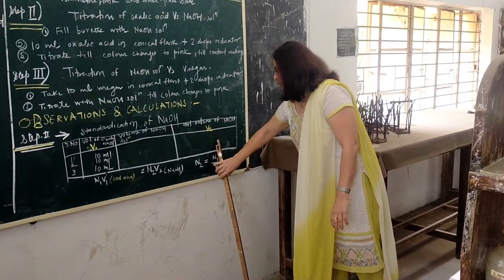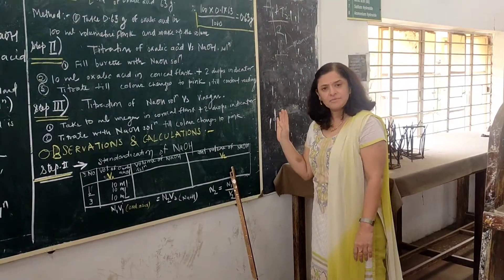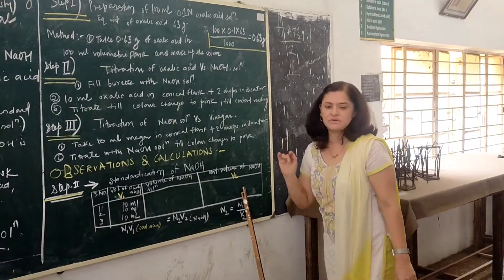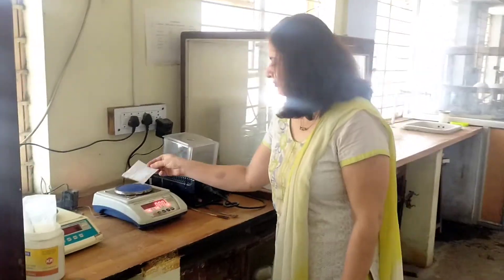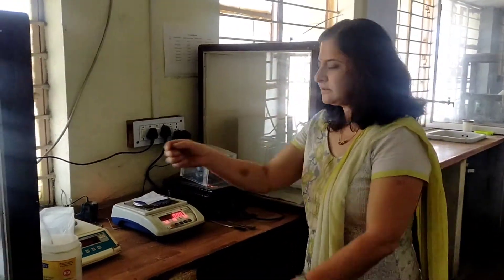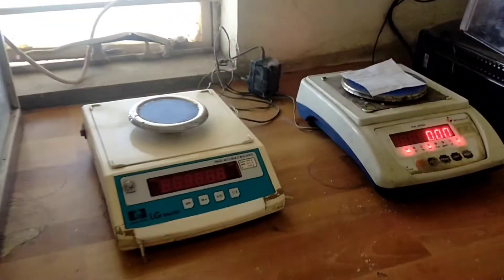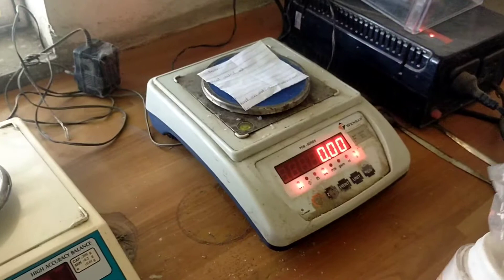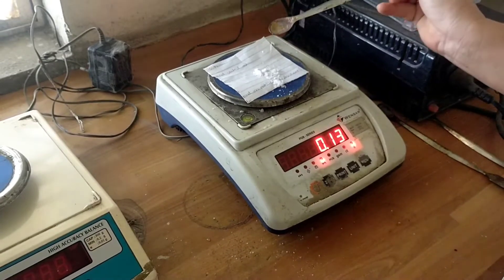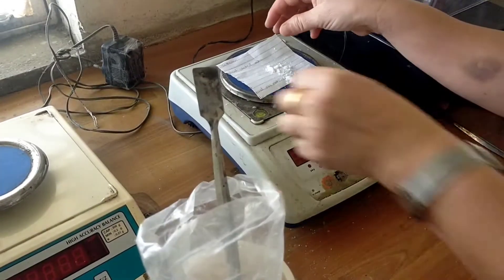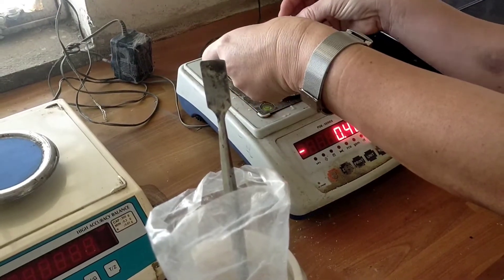Now we will see on the balance how 0.63 grams of oxalic acid is to be measured. We use this digital weighing machine. First we calibrate it by setting to zero. Now zero is set. Take 0.63 grams of oxalic acid.